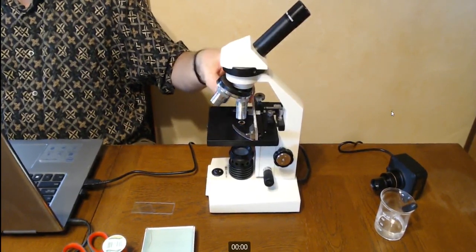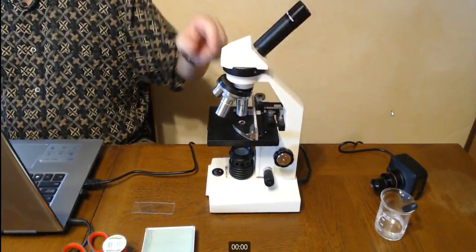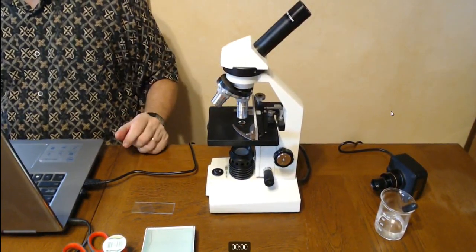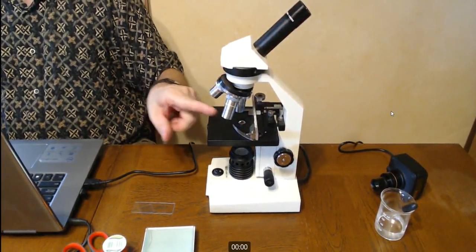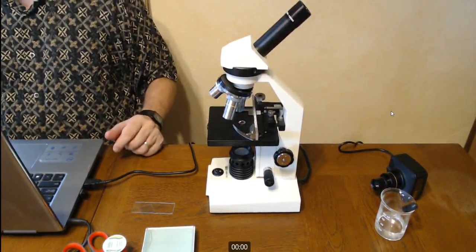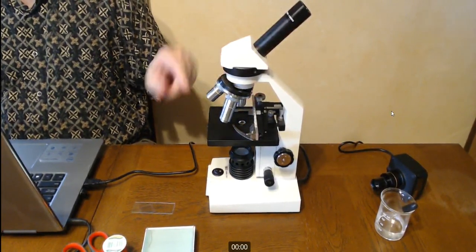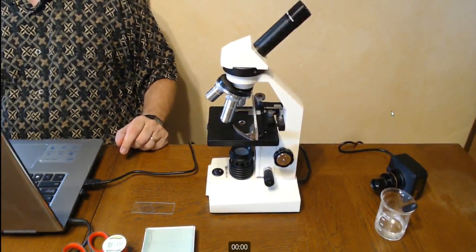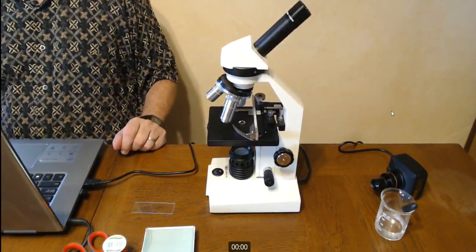Our small low power objective says 4 times. So 4 times 10 is 40 times. So anything we look at through the low power objective will be 40 times. Our medium power objective says 10. So 10 times 10, anything we look at through there, will be magnified 100 times. And then finally our high power is 40. So 40 times 10 will be magnified 400 times larger than it really is. So that allows us to see microscopic organisms.